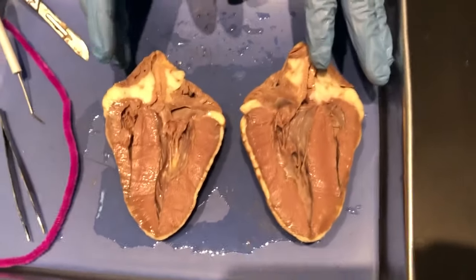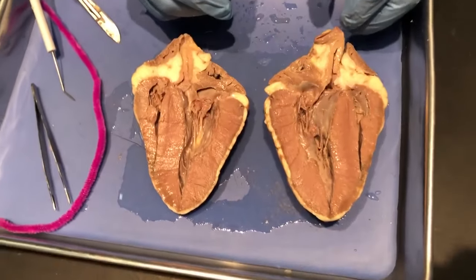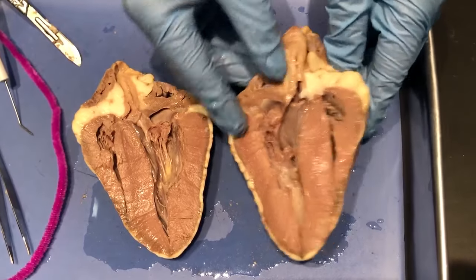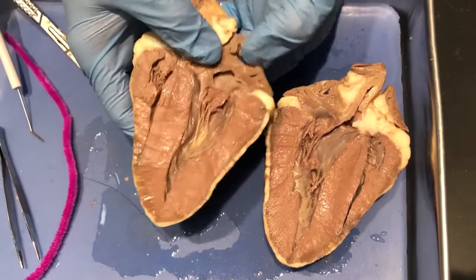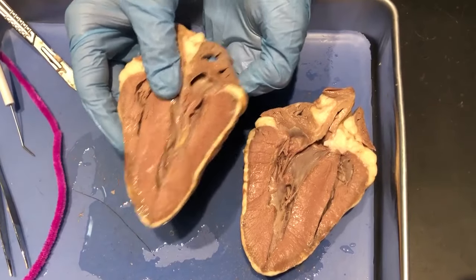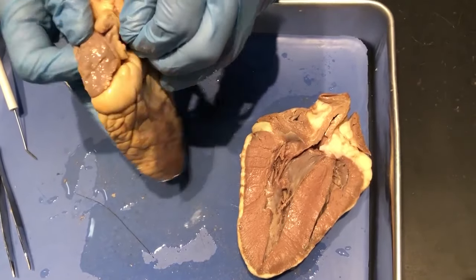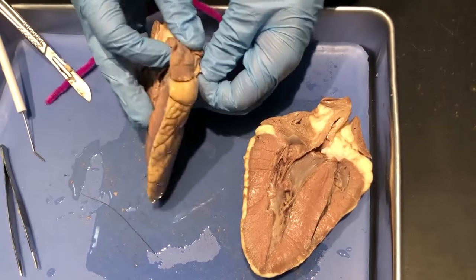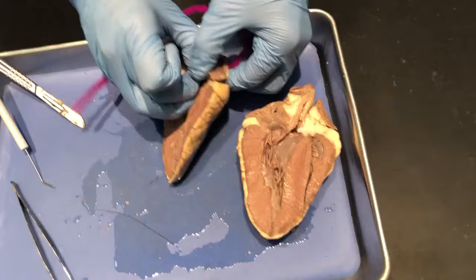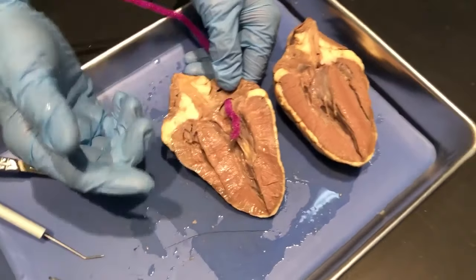There's the inside of the heart right there — please write down your observations in the comment section. There's a lot to really take in. Let's start up at the top — this is an atrium right here. I'm going to put this pipe cleaner through there to kind of highlight how blood flows through the heart itself. So we have up here the atrium, which essentially acts as a waiting room for blood.